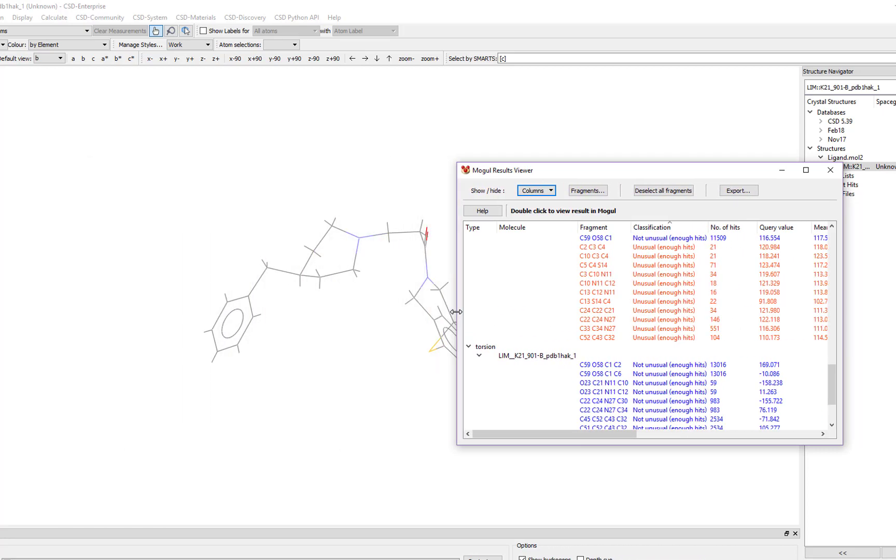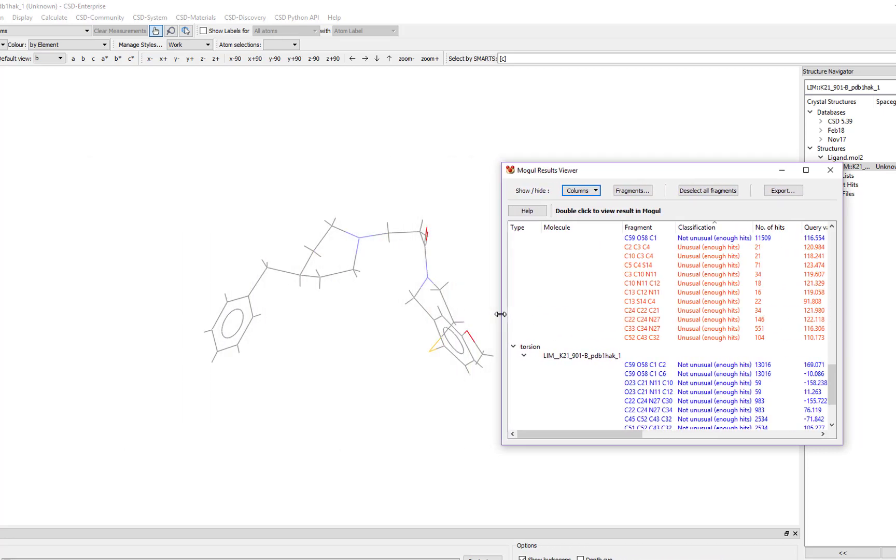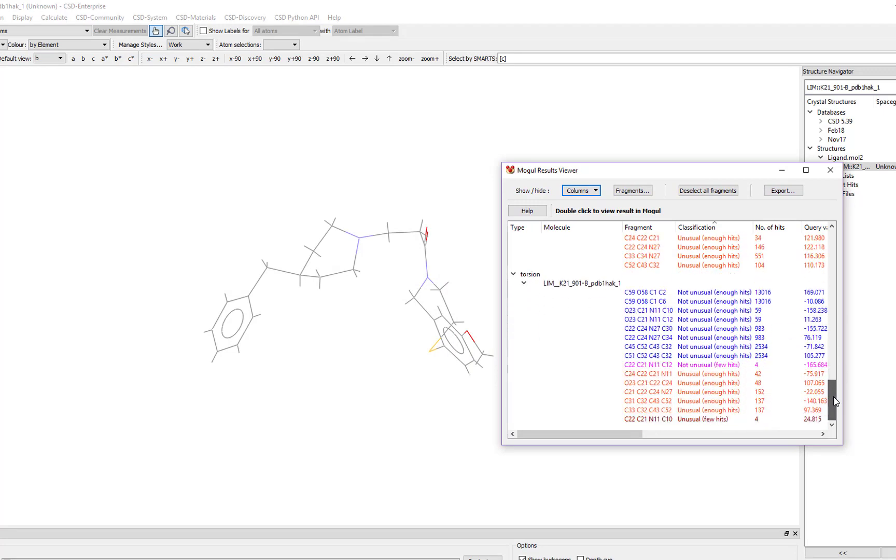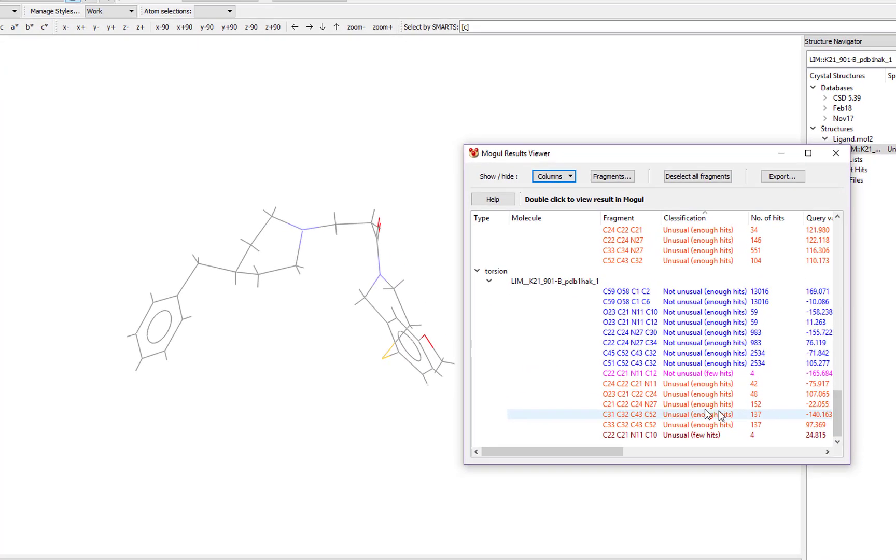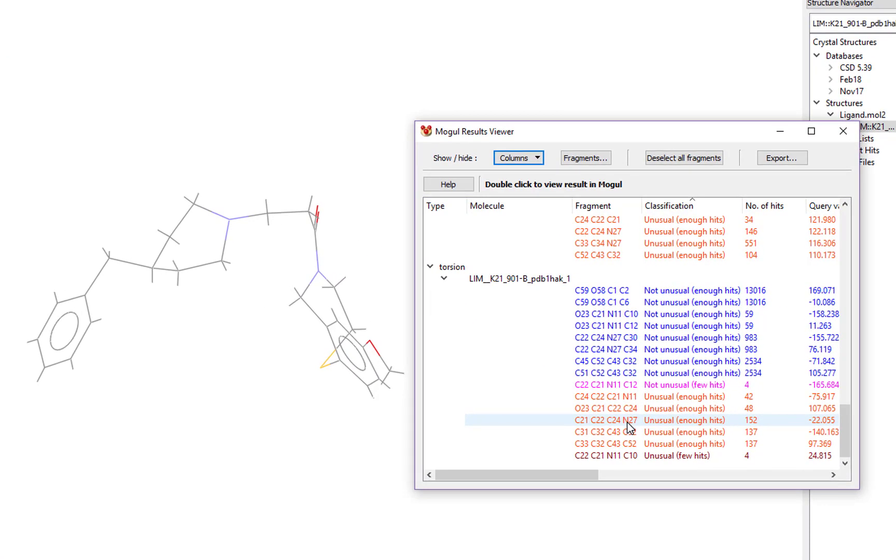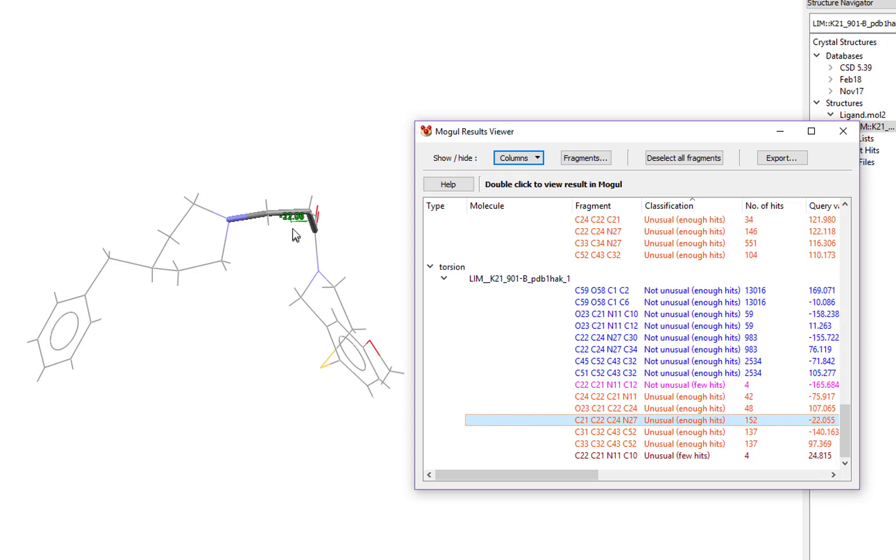To investigate the unusual parameters, simply select the line for the parameter that you're interested in. If we click this line, you'll see that the fragment is highlighted in our molecule in the Mercury window and the value of the torsion angle is displayed.